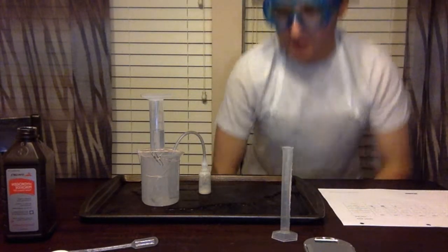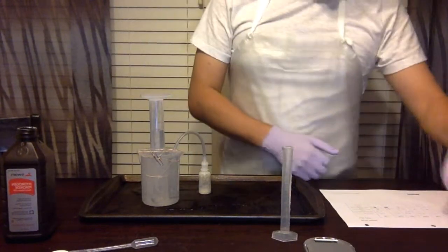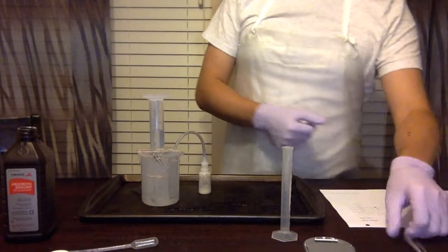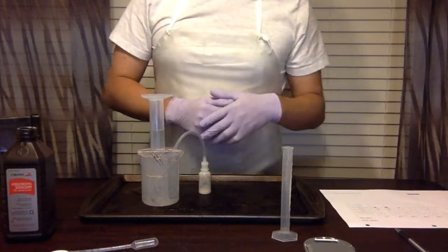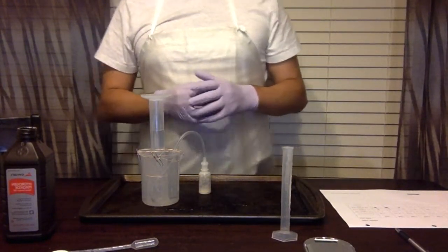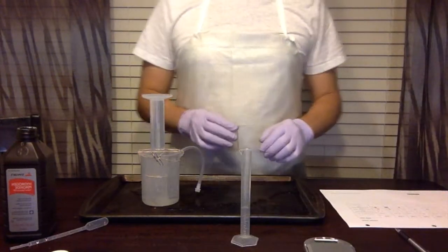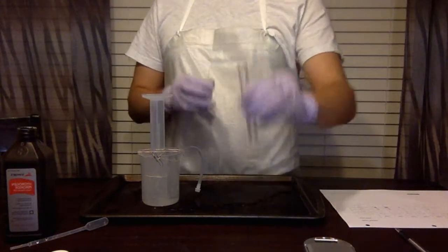All right, it looks like it's not going to rise anymore, so we're going to go ahead and record our data. It looks like 25 milliliters for trial number 6. And we'll be back for trial number 7, in which we will be using 4 milliliters of hydrogen peroxide. Commencing trial 7.